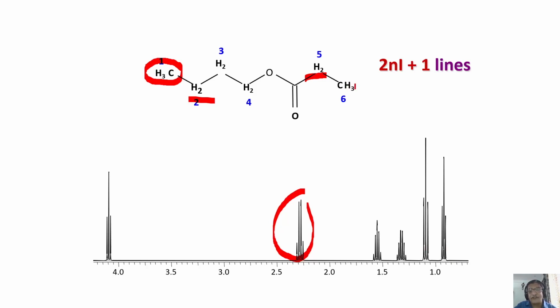When it is coupled to this quartet, measure this J coupling. Measure which one has a J coupling here. This separation and this separation has to match. Whether it is matching for this or this, that identifies which is the CH3. Alternately, look at this CH3. This is coupled to CH2. It's a triplet. One of them we'll see later.